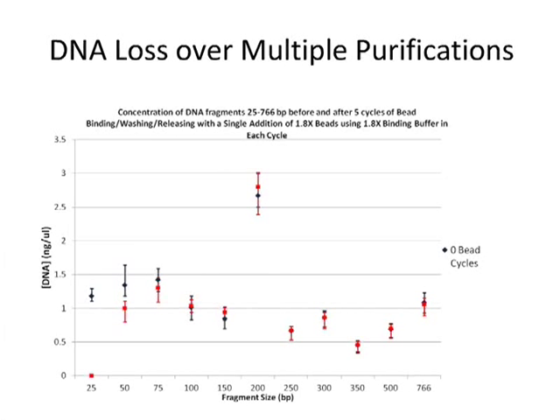In this case, it is retaining the same aliquot of beads, and then instead of adding new beads for subsequent purifications, adding the binding buffer alone. An easy way to do that is to take the same beads and just spin them out, and then use the binding buffer for the subsequent step. So you're still using the same amount of reagent for each step, but you gain a little bit of efficiency here.